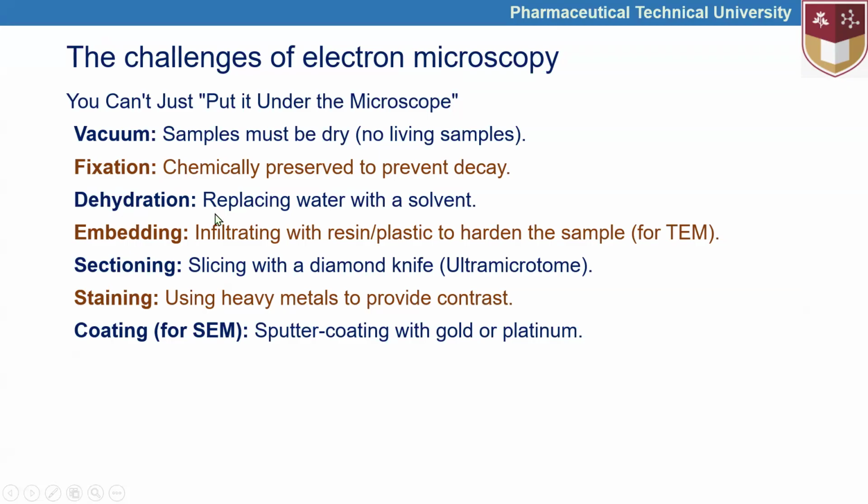The sample should be dehydrated, replacing water with a solvent, and infiltrating with resin plastic to harden the sample is required for TEM.